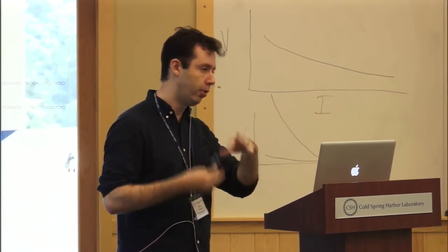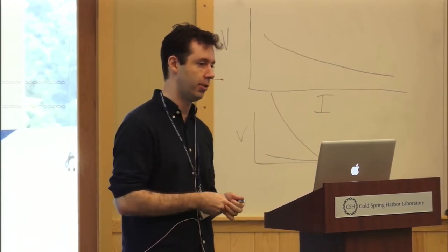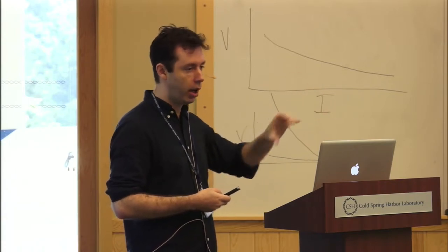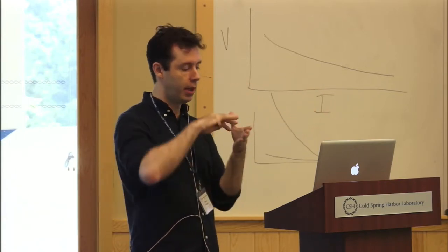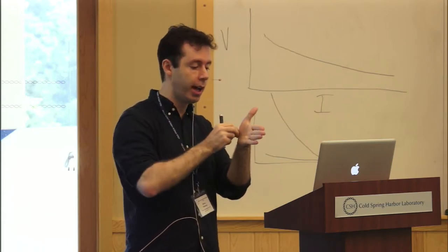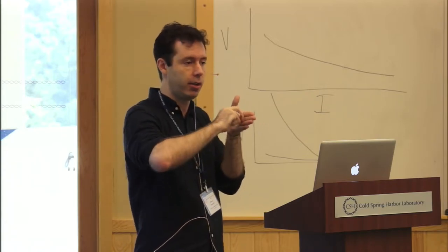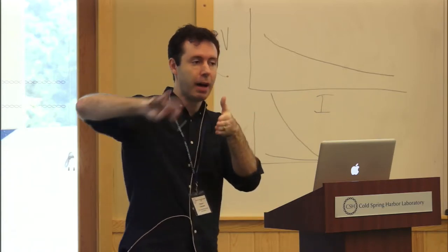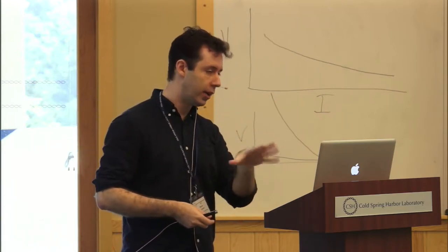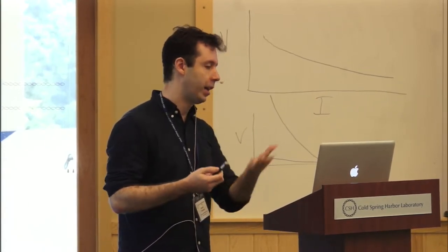You have to be careful because sometimes people might not tell you that you have adapters in your data. The good thing is that a lot of your aligners now, like BWA, are able to clip out extremities of reads that don't map at all to the genome. They say, okay, I'm mapping the first 50% of the read, and then suddenly the rest doesn't map at all. So it clips out the non-mapping, potentially adapter parts. Some of the aligners are now smart enough to take care of that by themselves.